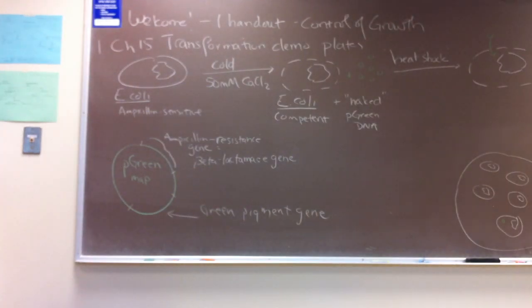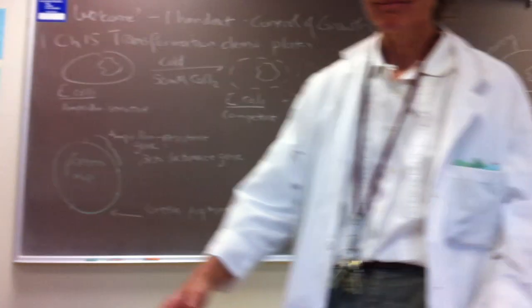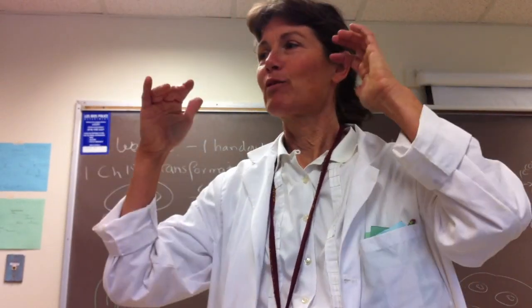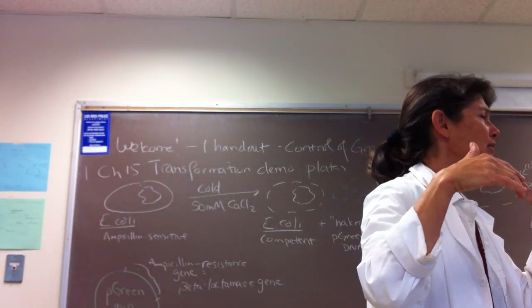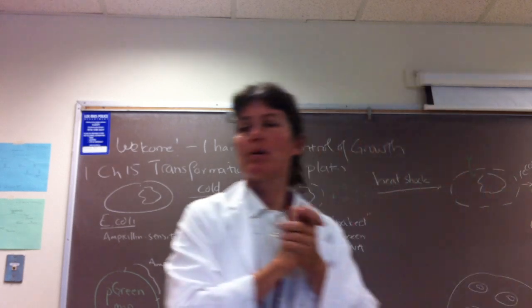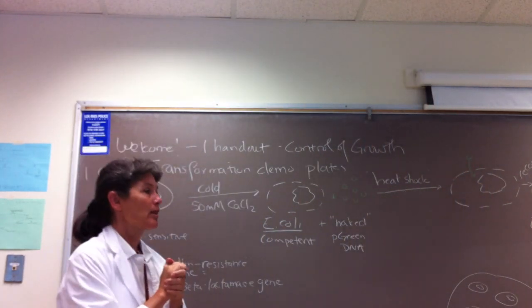Professor Holland, board and... okay, they're hiding. You will find the transformation plate. It's probably right in front of you, right? Transformation plate. No, looking right at them. We'll find them, guys. Oh, we'll find them.